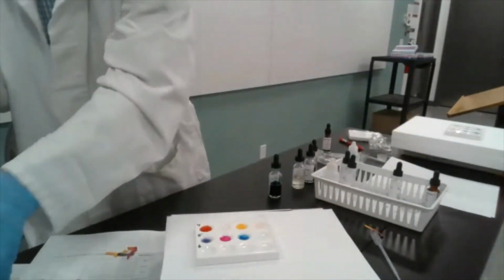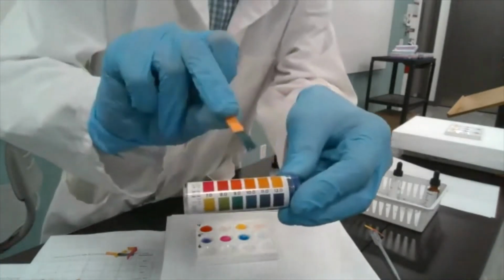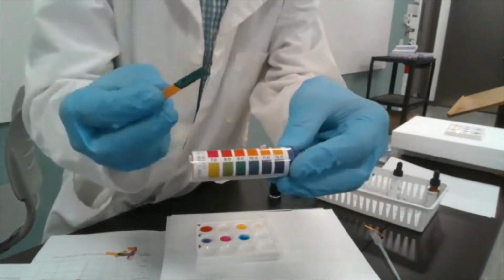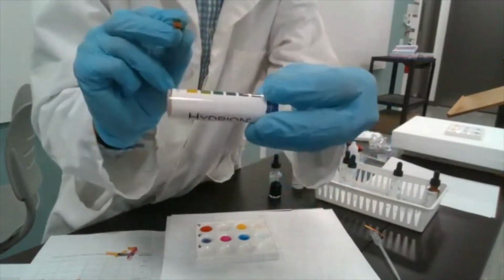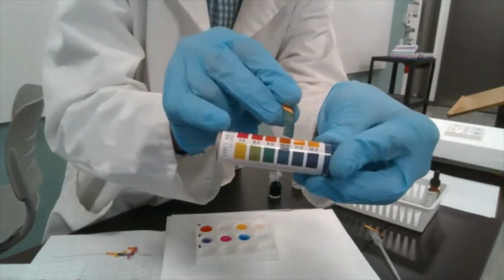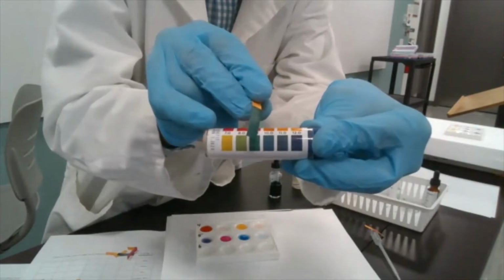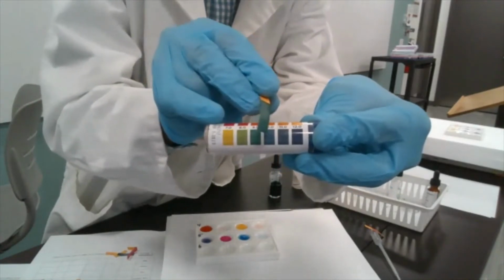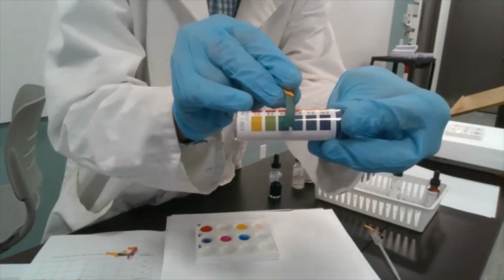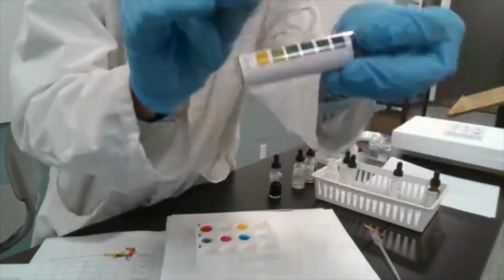But dip one of these strips into the glass cleaner. Let's see. Again, dramatic color change. Let me just let it soak up the liquid. Let's look. It's not that deep. It's probably not 11, but I would say this is between maybe 9 and 10. Probably closer to 9, because I think 10 has almost a bluish color, and 9 is greenish. So I would say 9.